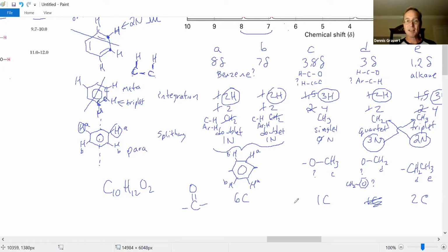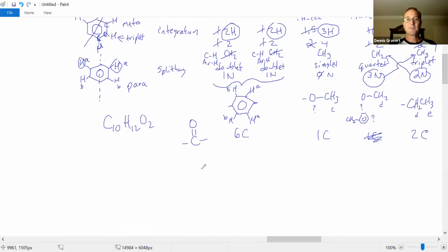All right, so what have we got? Let's rewrite this because it's so messy. Right now I'm thinking there's 10 carbons. I only counted 9 in my group so far. So the 10th carbon, I'm gonna put attached to the double bond O for my 5th degree. 2 bonds to that carbon. Got a benzene ring here. Got some H's.